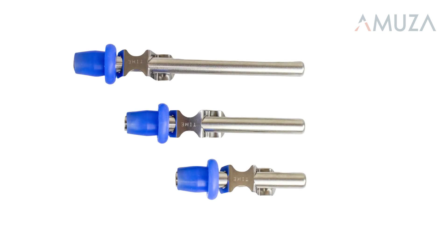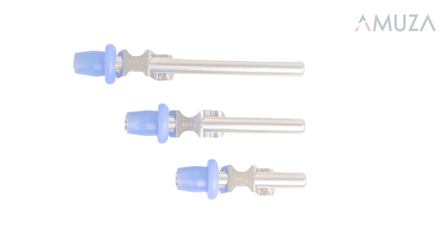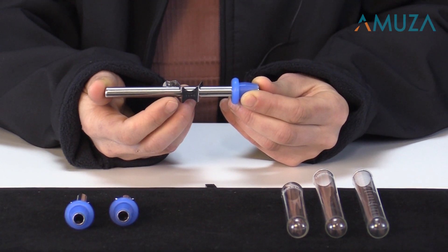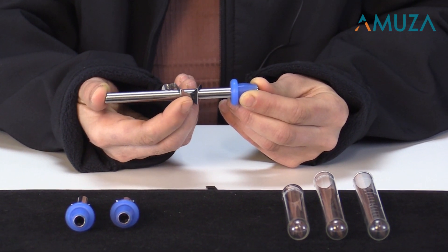Each tube also contains a clip that attaches the sipper tube to the cage in order to stabilize the bottle to the top of the cage. This prevents it from being knocked out of place by the mouse or rat. This clip can also be adjusted so that you can adjust the length of the nozzle inside of the cage.